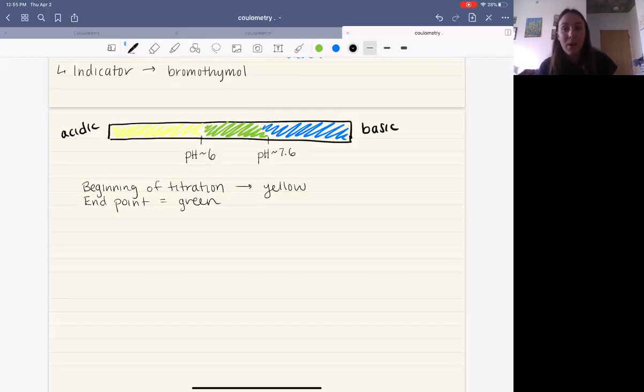I want you guys to think about what kind of error that might cause on that first trial. If there's already acid in there, then when you do your first trial, that one should take longer to neutralize, right? That's going to be a systematic error on that first trial caused by the acid that's already in the solution. If that's the case, you might want to address that in your analysis. One other solution, a proactive solution, might be to neutralize before you even do your first trial. And that would be a blank titration.